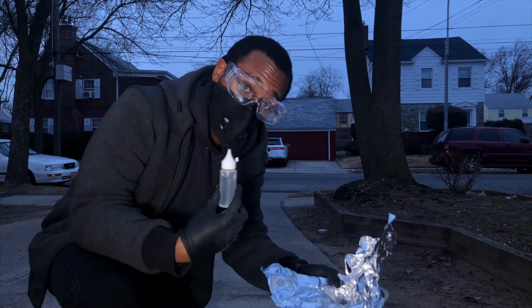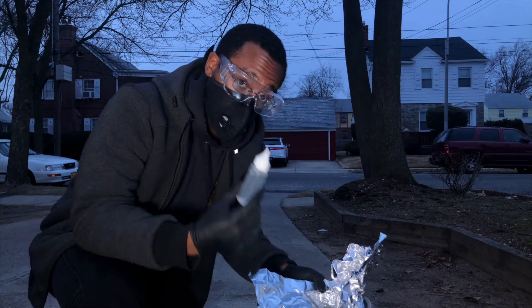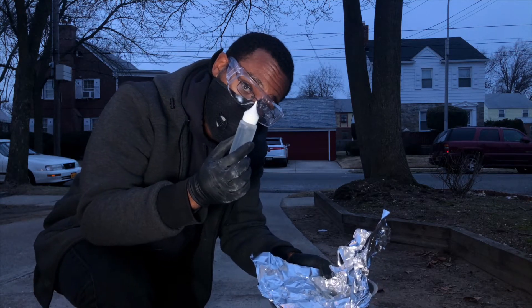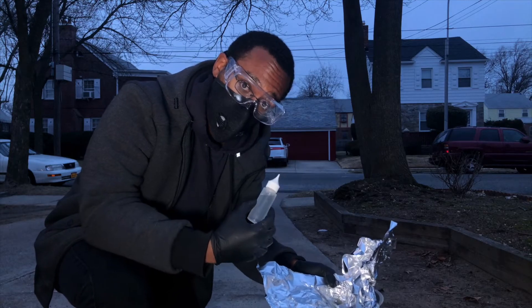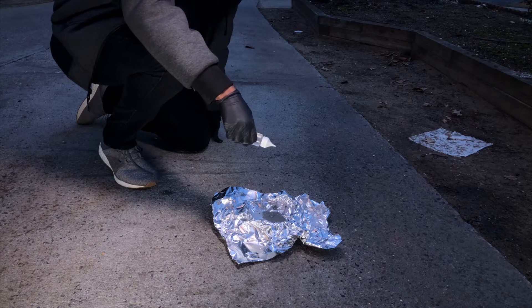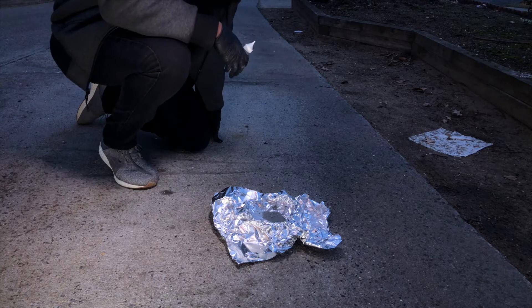For safety concerns, as you can see I'm wearing a protective mask in addition to safety glasses. We're outside, so now I'm going to try to drop some of this water in here and see exactly what happens.